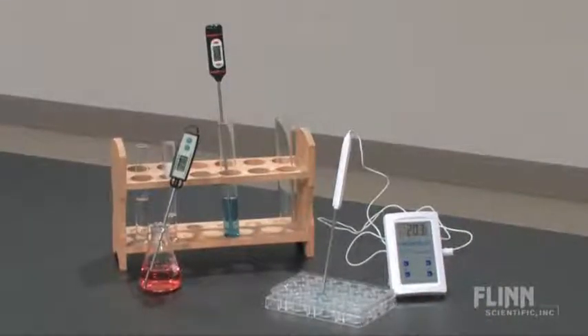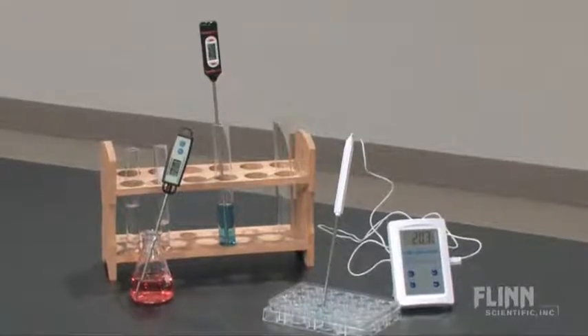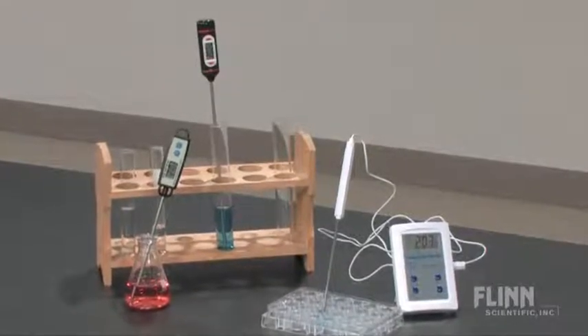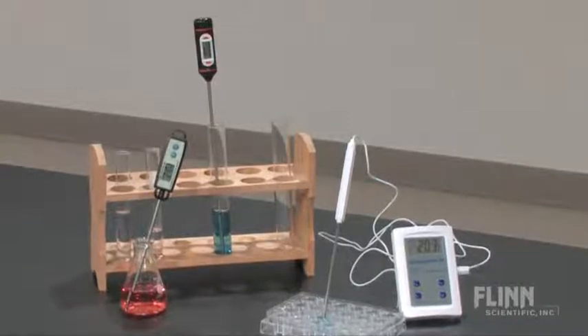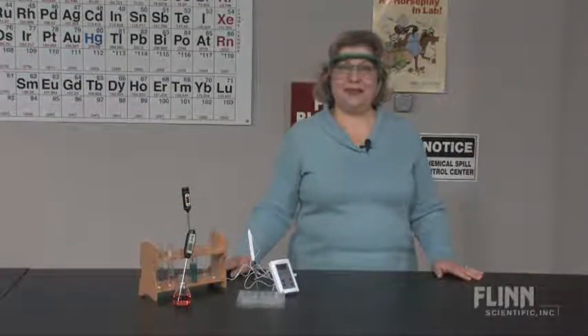There are three models to choose from. All Flynn Digital Thermometers have chemical resistant stainless steel probes, on-off switches and buttons to select the temperature units. Find the style, size and price that will meet your needs today.